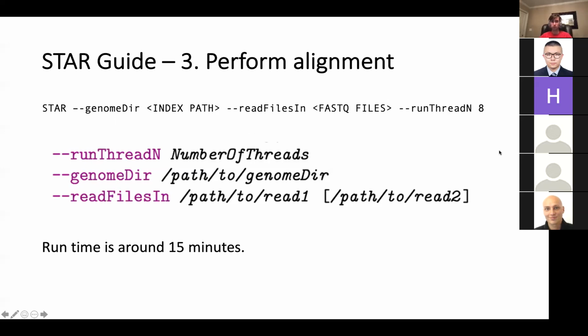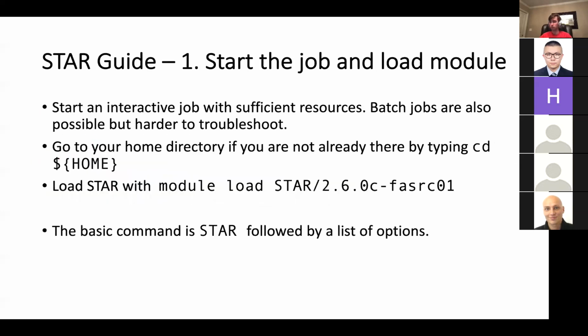Sorry, do you just type in that command to load STAR? When I paste it in, it says command not found. Module load this didn't work. Oh, I didn't include the module, I think. Yeah, sorry, so module load. And if you don't know what STAR is called, you can always type module query and then some string. Like if you didn't know what version you wanted, you can type module query star and it'll tell you what versions you have available.